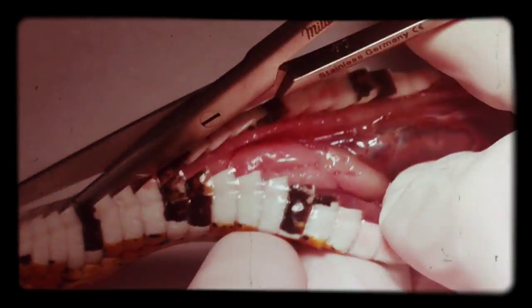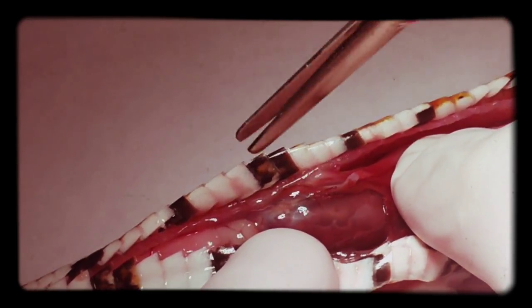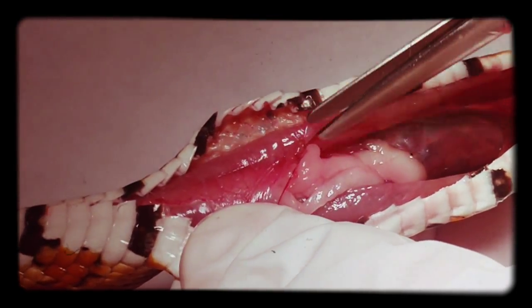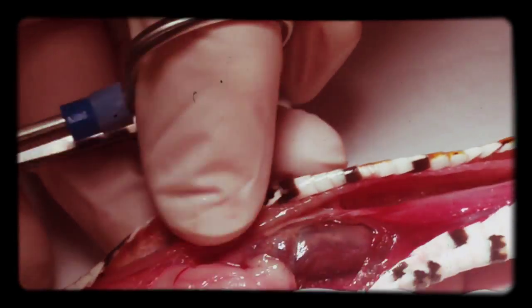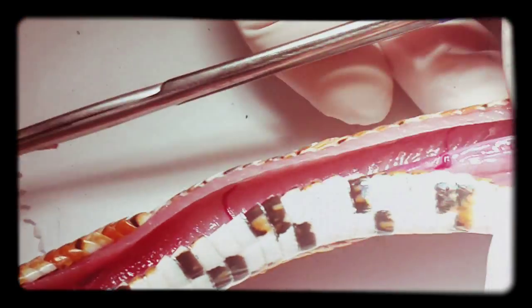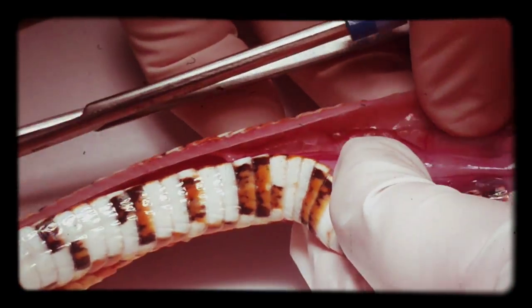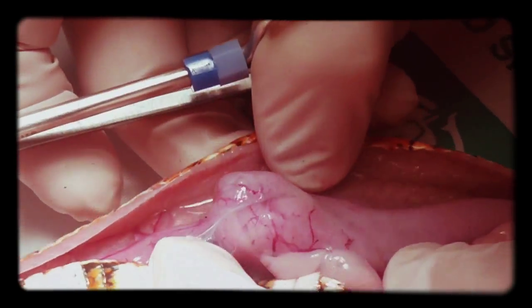There's that little bitty heart, little tiny target. There's that little bitty heart. Okay, and what's the stomach? That's the stomach.